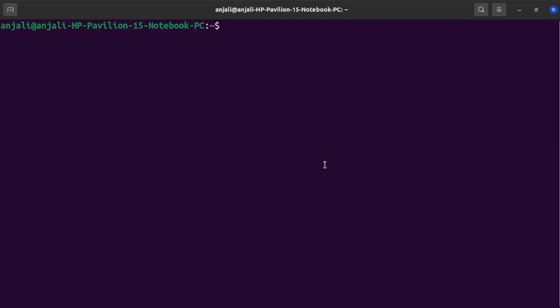Different tools are packaged in what Conda calls channels. We need to add some channels to make the bioinformatics and genomics tools available for installation. A channel is where Conda looks for packages, basically. Now we create and activate a Conda environment for some tools. Now we can easily install software into the activated environment by using the command conda install package name.